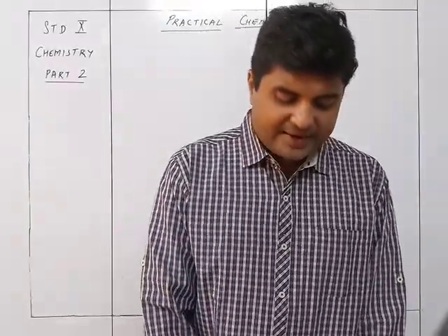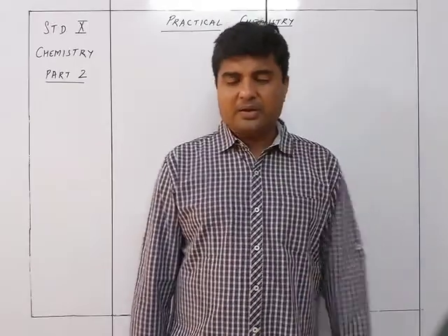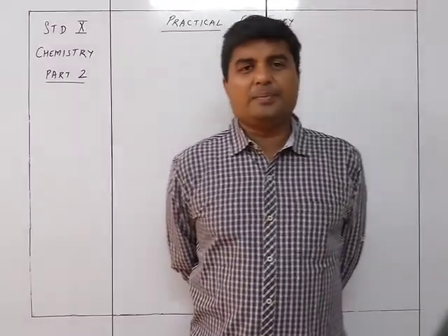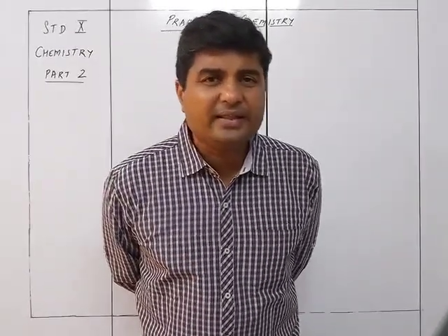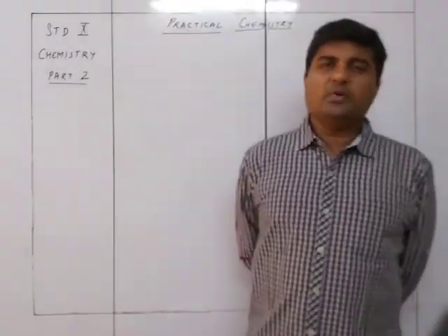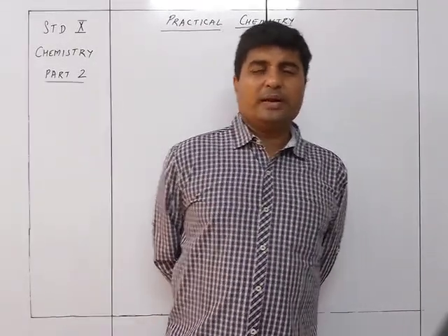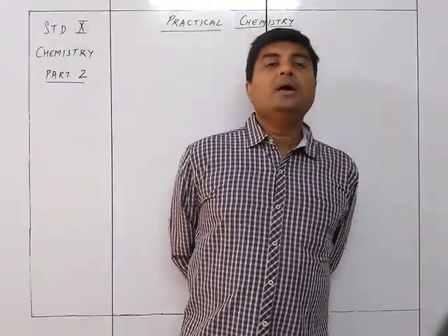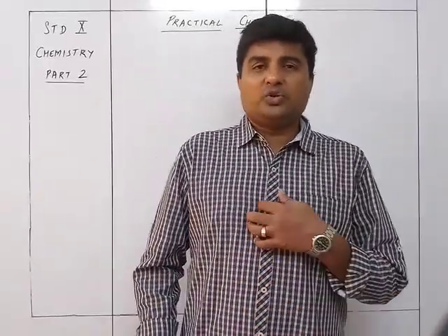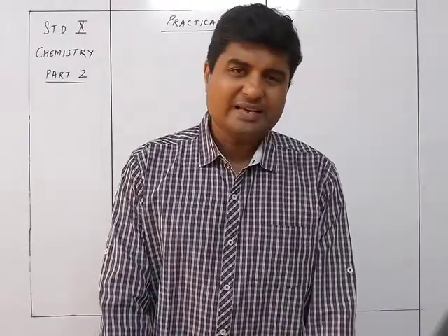Now we see the next thing, and that is the cations, that is the positively charged ions present in a particular compound. The cation test is nothing but the same test we studied in analytical chemistry and also in the ammonia chapter. In the ammonia chapter, we studied the parts which were there for ammonium hydroxide. We did not study about NaOH there. As far as analytical chemistry is concerned, the complete thing is well understood by us. So we'll just quickly go through them one by one again, so that it recaps the whole thing.